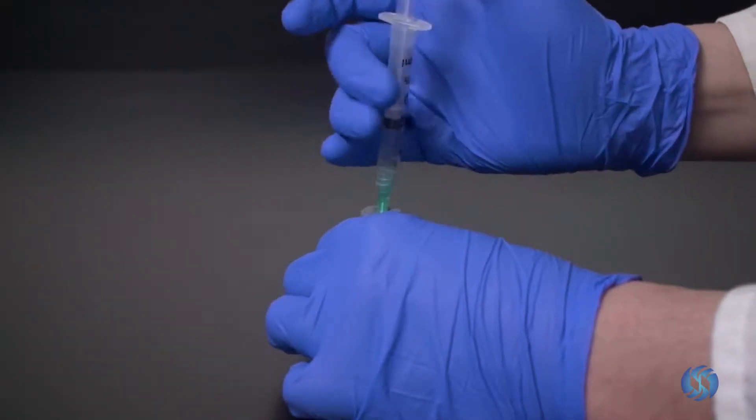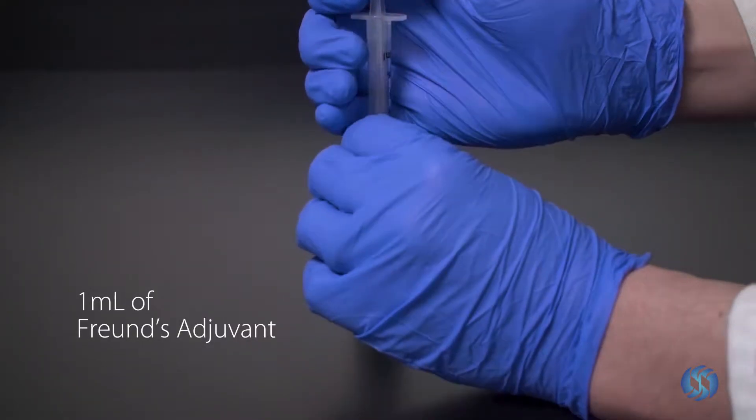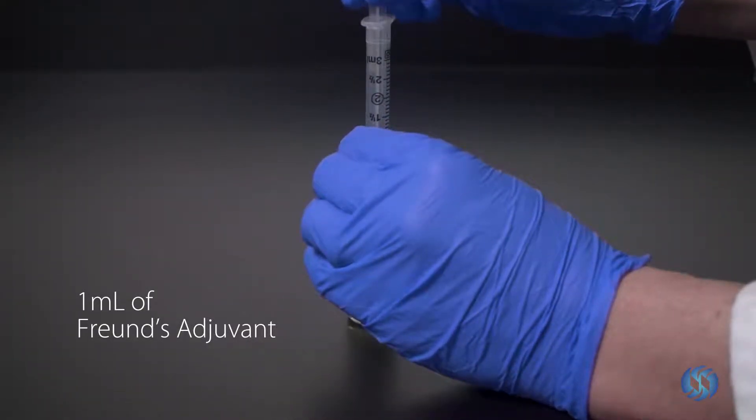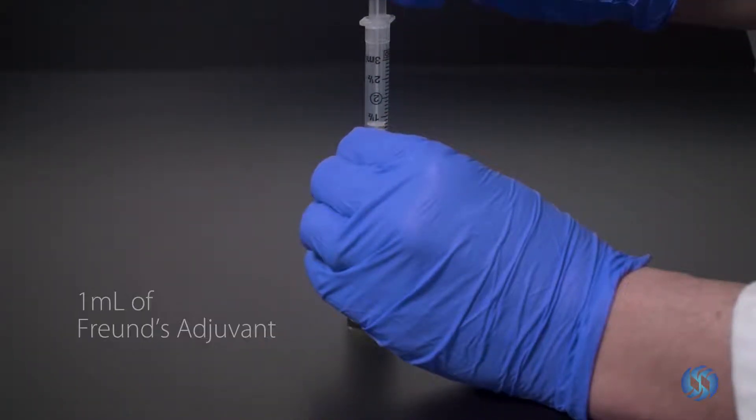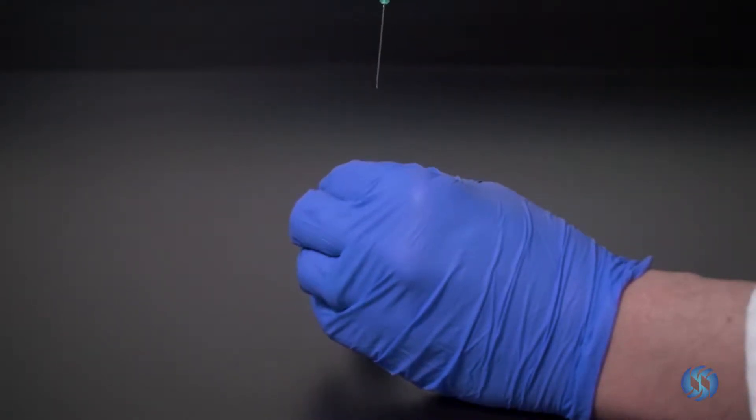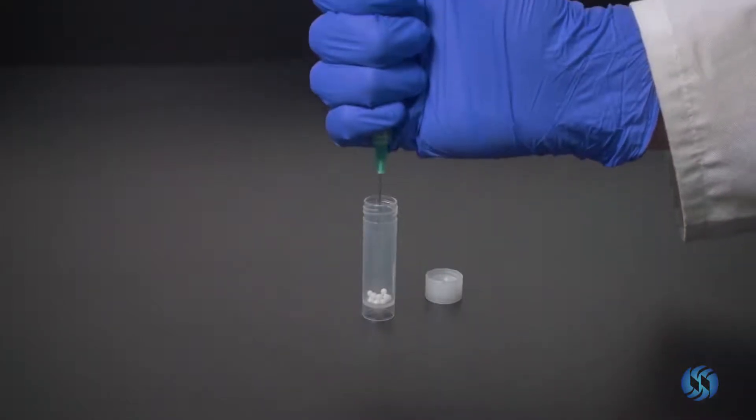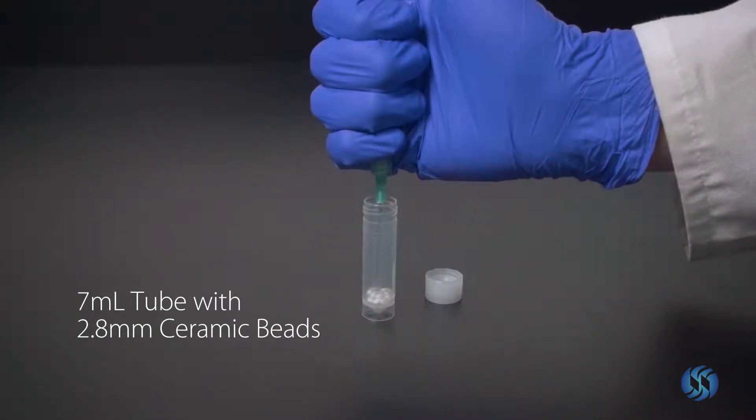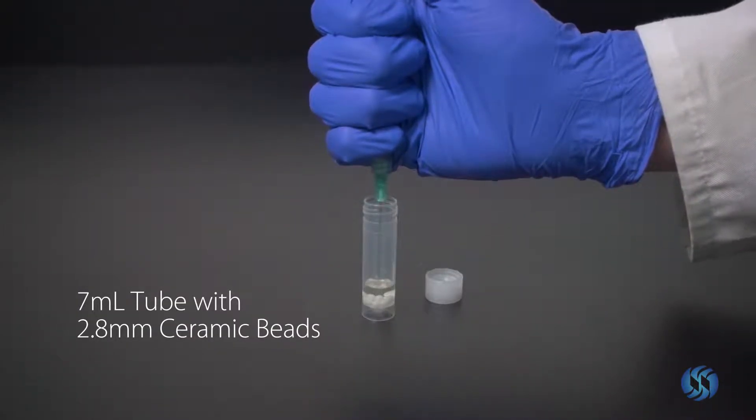To begin, use a syringe to extract one milliliter of Freud's adjuvant. Inject the adjuvant into a 7-milliliter tube prefilled with 2.8-millimeter ceramic beads.